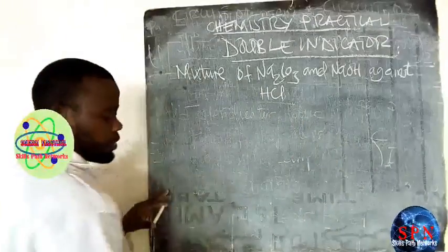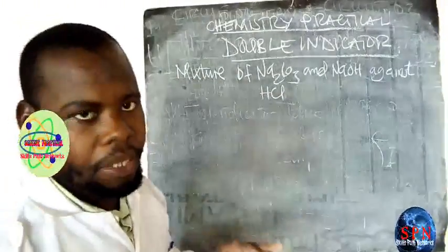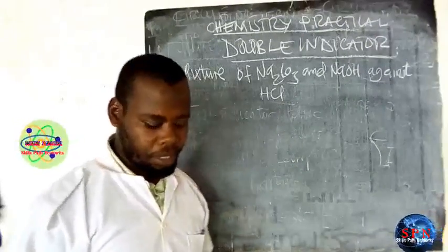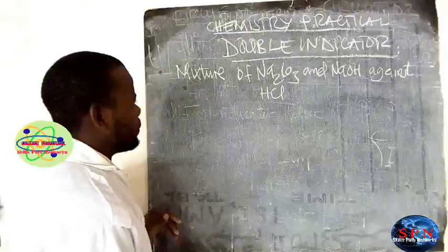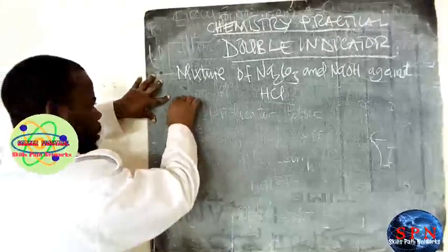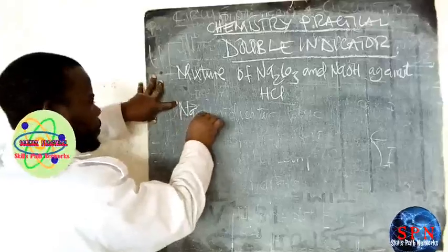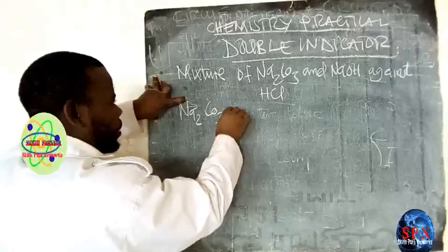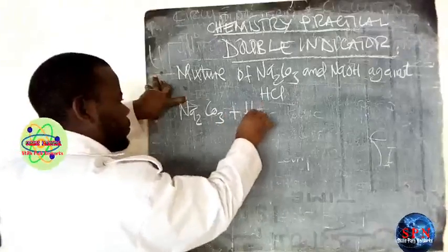Then after the titration, what are the reactions taking place in today's experiment? We have sodium carbonate reacting with hydrochloric acid.